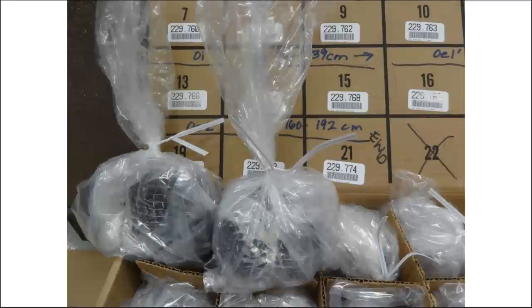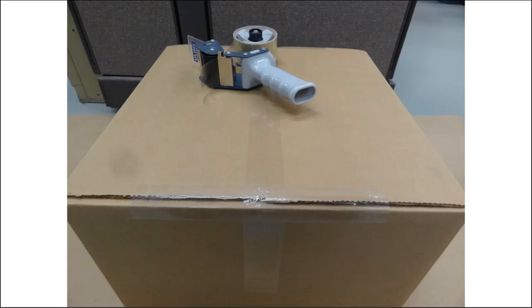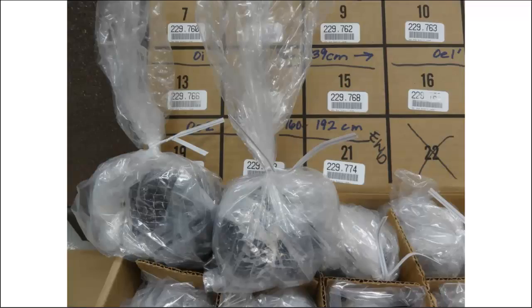Let me go back. I thought I had a picture here of a properly labeled clod box, but I guess that's in another document. Somebody asked about that yesterday. For a properly labeled clod box, you need to have as much information as you can, but at a minimum, like I said yesterday, the user pedon ID with the layer number, and then if you can get the horizon designation and the depths in there, that would be great too.